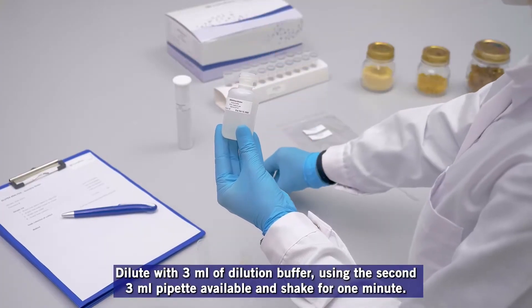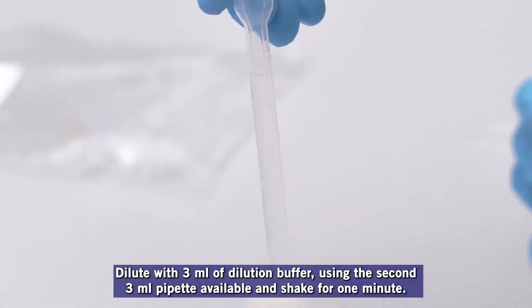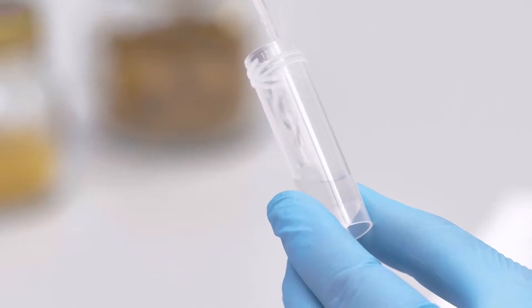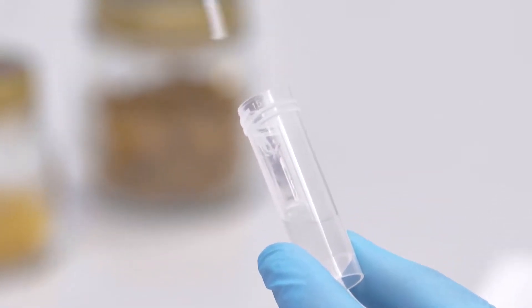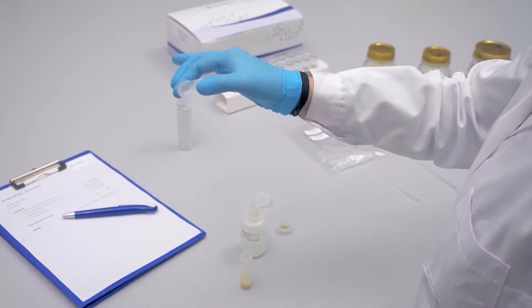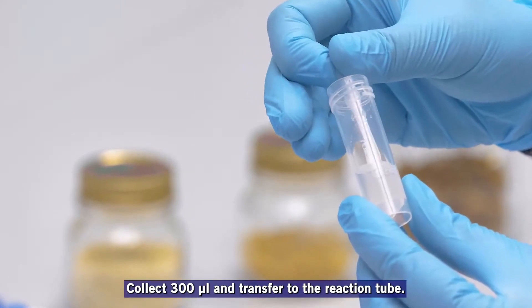Dilute with 3 milliliters of dilution buffer using the second 3 milliliter pipette available, and shake for one minute. Collect 300 microliters and transfer to the reaction tube.